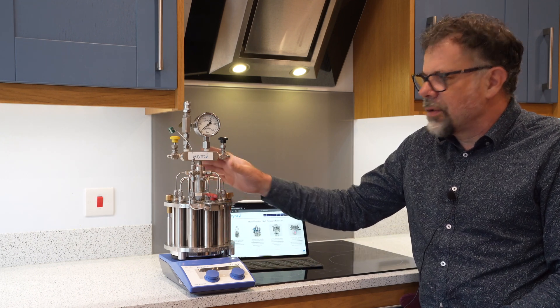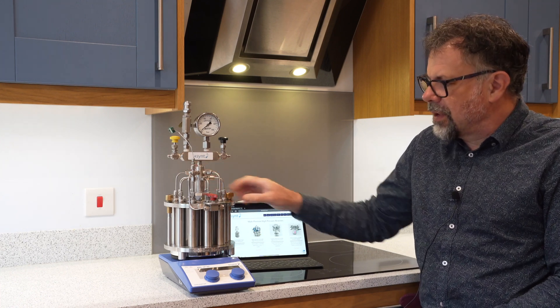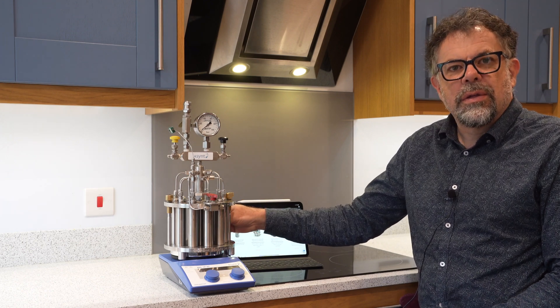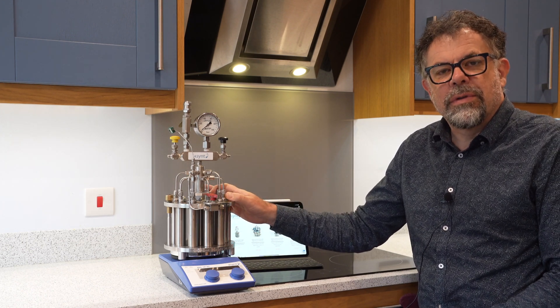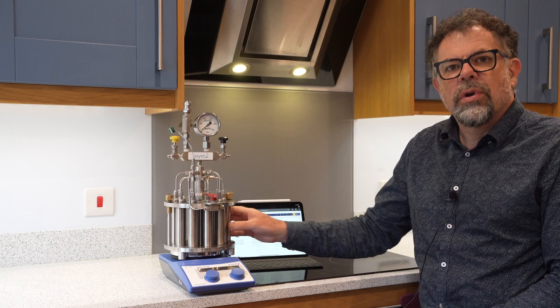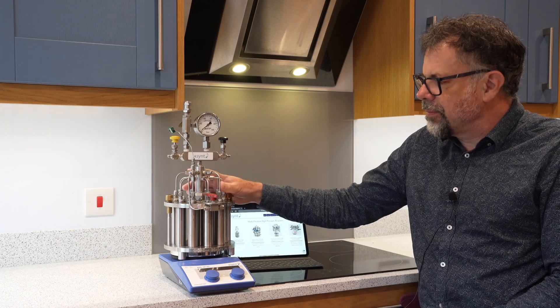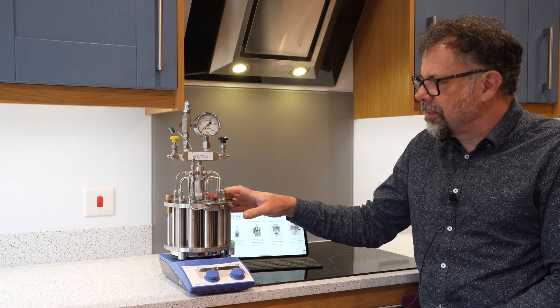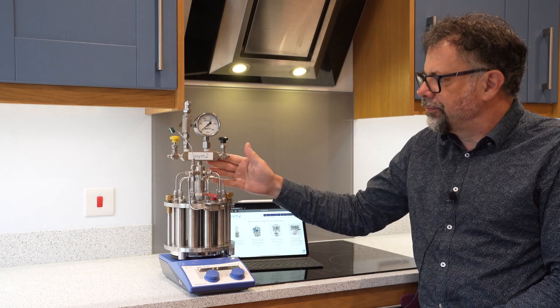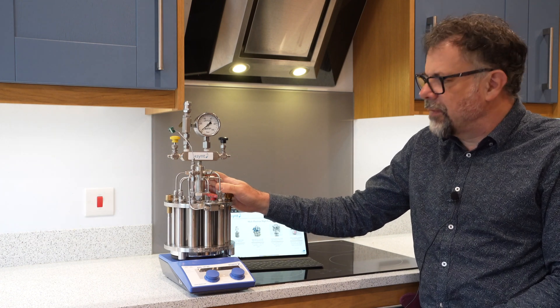As standard in its basic configuration, as you see here, we have 10 parallel reactors. Everything is made from standard 316 stainless steel. Pressures to 50 bar, and a single closure so they all seal together, and a single unified gas feed so they all have the same pressure and gas control safety.